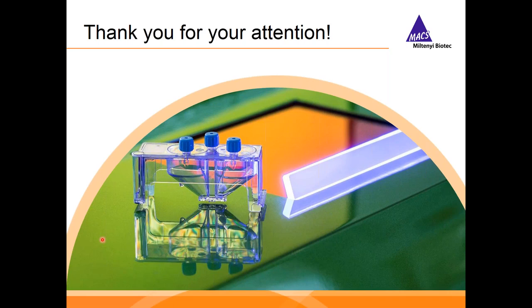That's great. Okay, we have a few people actually asking the same question about backscatter. Why is the Tyto using a backscatter and not a forward scatter? This is a popular one. Yeah, that's an interesting question. And of course, the forward scatter is a normal thing to find if you work with scatters and flow cytometry. Everyone's working with a forward and the side scatter.